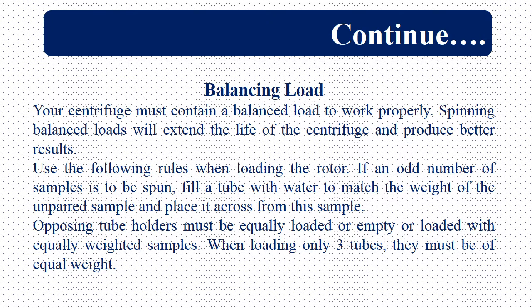Sometimes, if we have a test tube on one side and you don't have a test tube on the other side, then the lighter part of the centrifuge will go up and the heavier part will go down. Vibrations will be created and there will be disturbance. Opposing test tube holders must be equally loaded and populated or loaded with equally weighted samples.